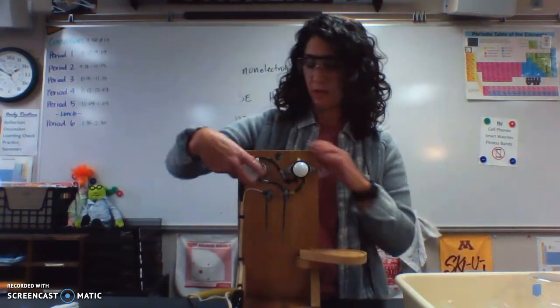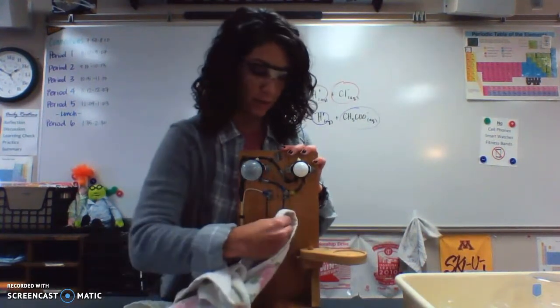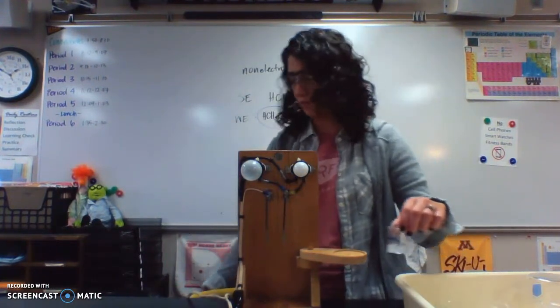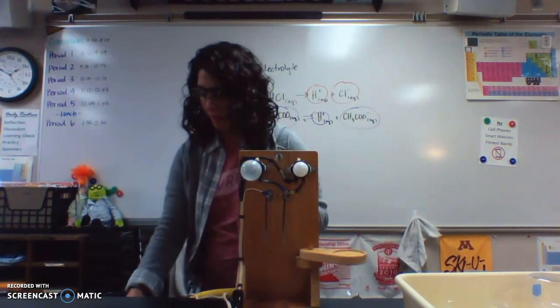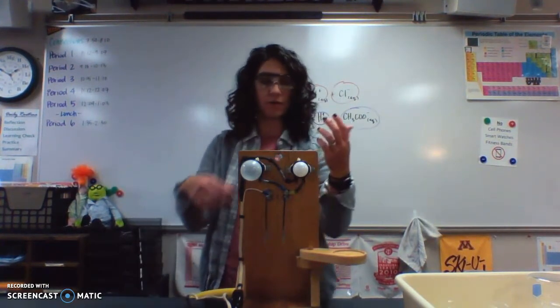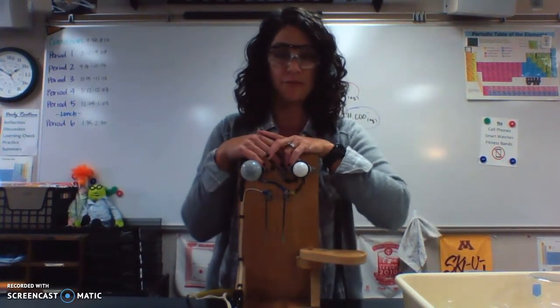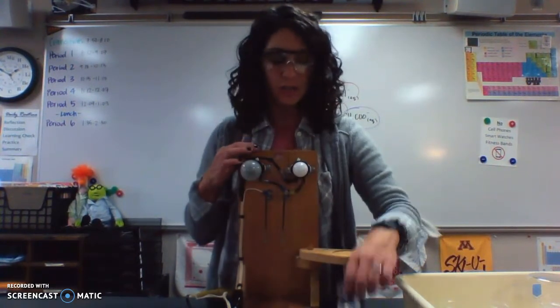Okay, so that should be all of your data. You have more to fill in on that table and then some questions and some equations to write. But just for fun, I want to do one more. You don't have to add this to your data table, but we talk about Gatorade as having electrolytes. You've heard it in the ads, you've seen it on the bottles. You've probably thought, oh, I need to replenish my electrolytes. No, probably not. Okay, so I have Gatorade right here.